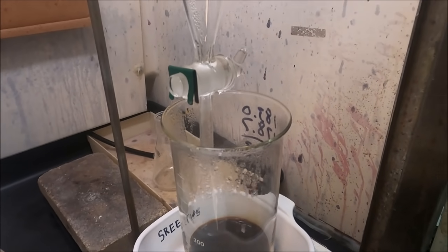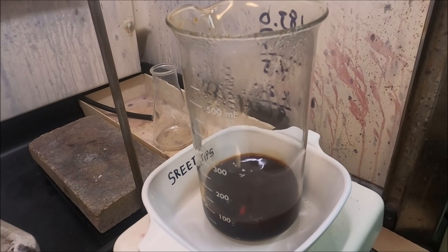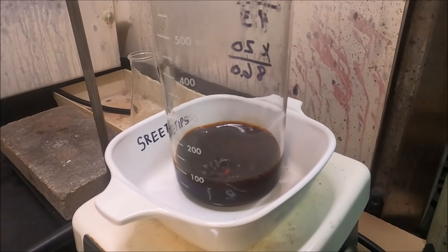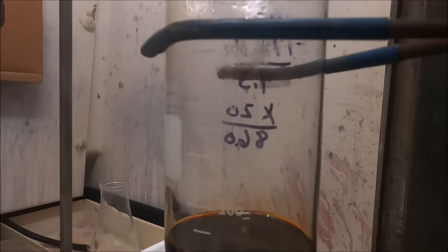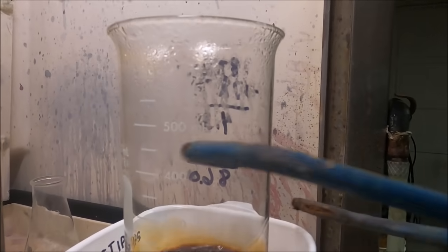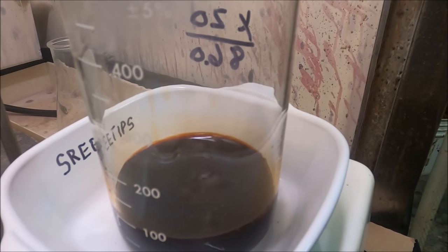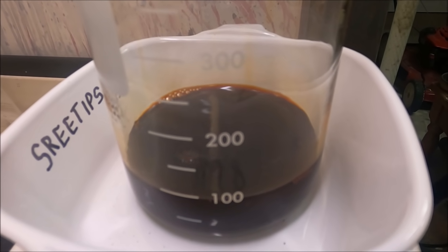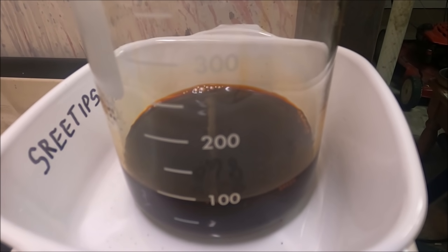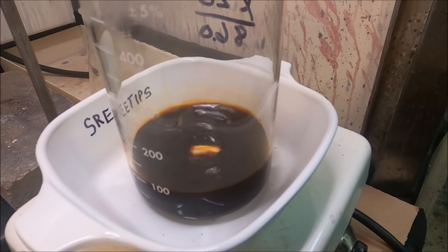I've added the hydrogen peroxide and this has been stirring now for about an hour, maybe a little longer. What we're going to do now is take a look — I think we've got it all dissolved. I've got it at about 100 milliliters, and I need it just a little bit lower. I may need to continue letting this heat up until I get it down to about 85-86 milliliters and go from there.